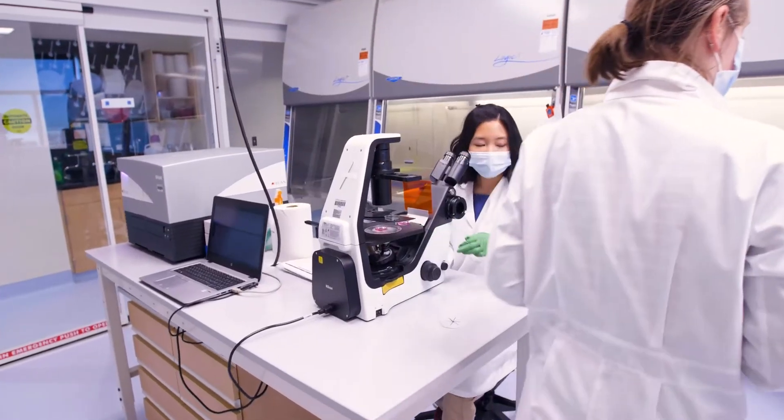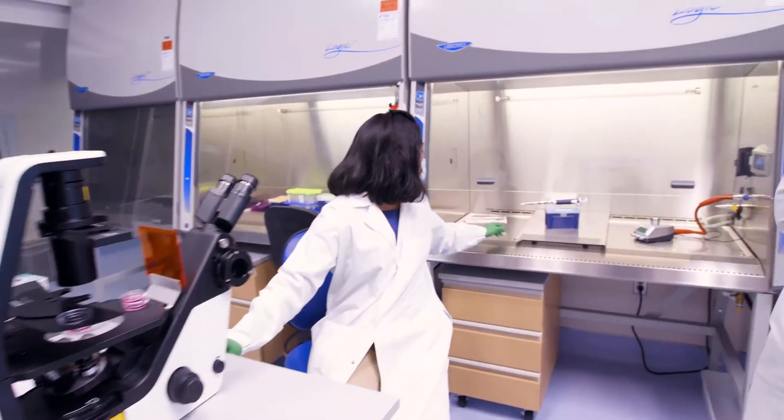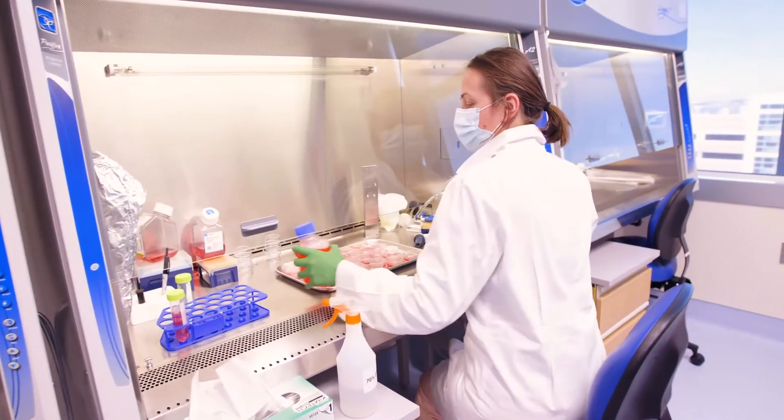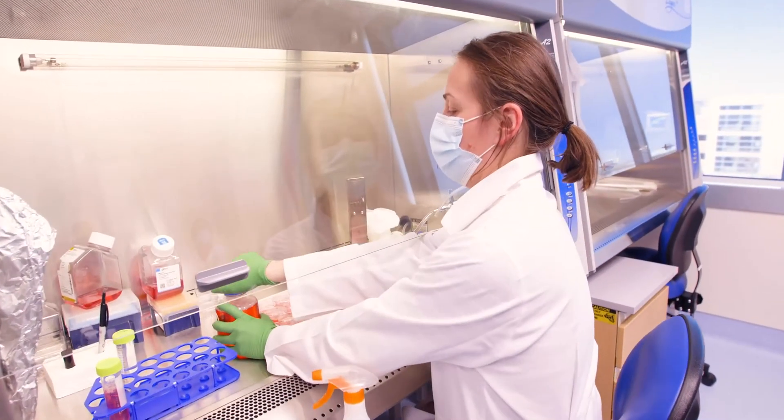but also have increased yield, decreased variability in their generation, and can provide solutions that can be quantifiable so that they can be applied to a drug screening scenario.